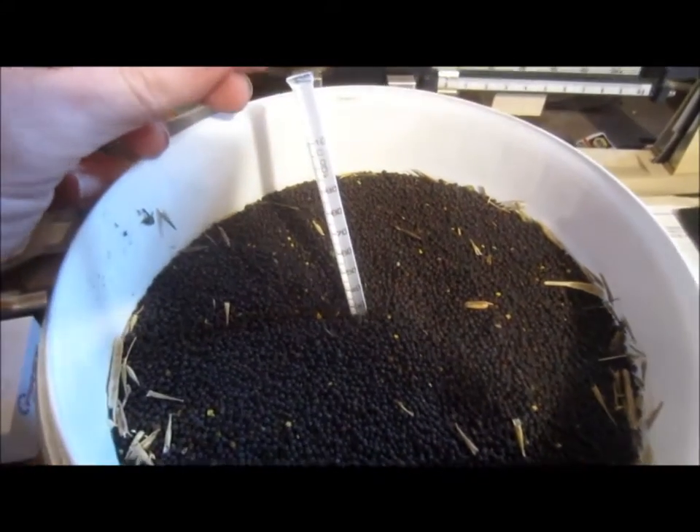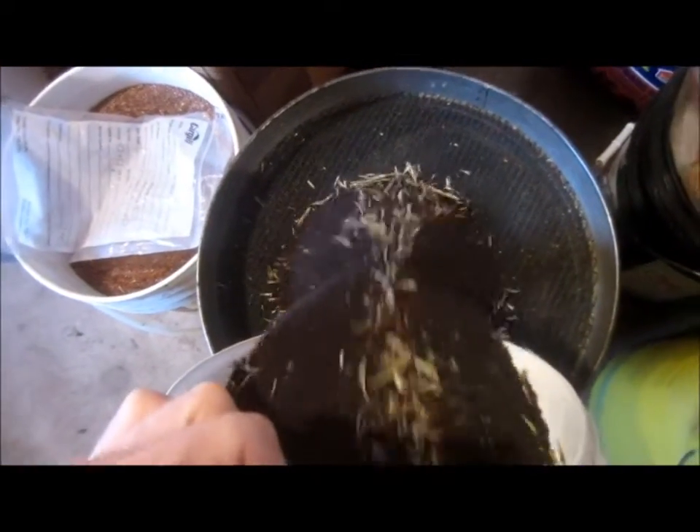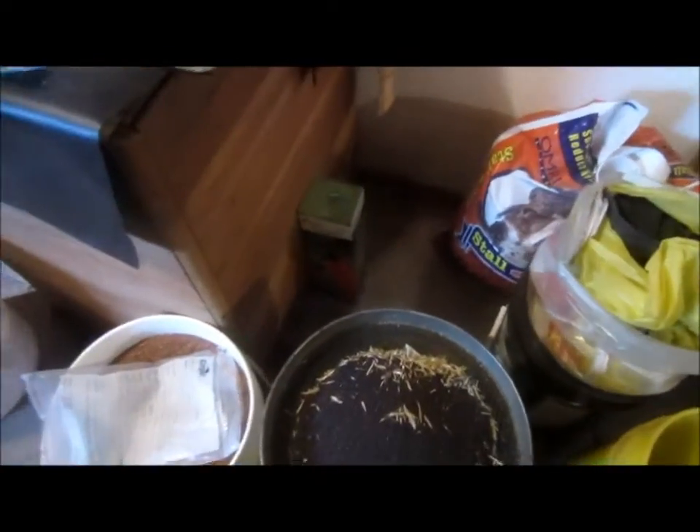I'm going to clean up a little bit of this sample here. I don't have the proper canola screens, but this one will sift out some of the fines and make it a little cleaner basically. We shake it around and around until the fine stuff falls through.